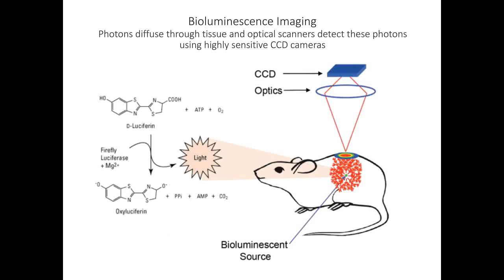So going to the first one, I'm going to split this into 3 sections. The first one is on optical imaging, mostly focusing on bioluminescence imaging. The idea is very similar to fluorescence imaging, so I think it would cover both. So just a general overview of bioluminescence itself.